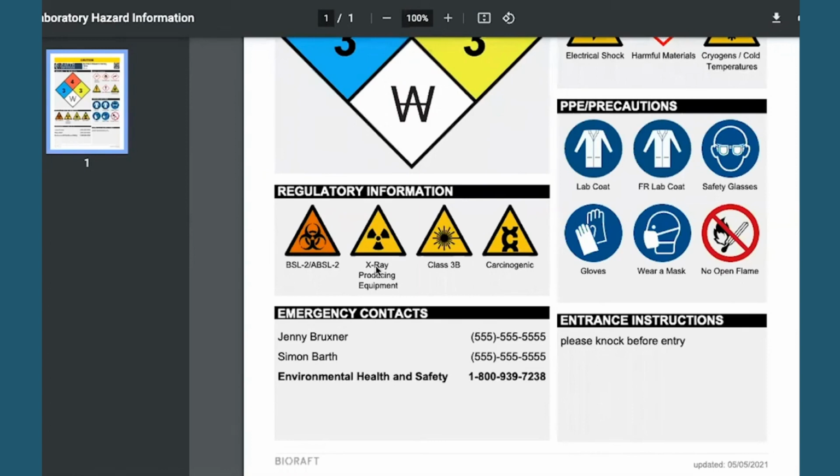So that is prohibitive in the case of an emergency, just having to do these tasks on this level. Making it easy, making it accessible to our laboratories to be able to build them up, or people in charge of spaces, allows for this to be uniform across the site. We also see that we have emergency contacts information here and things that are going to be permanent. So this is already brought in. We don't need to add this every single time.